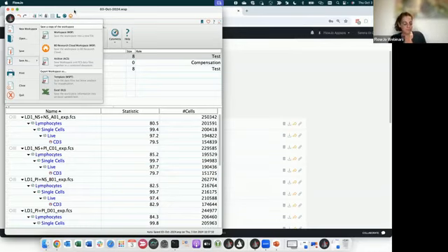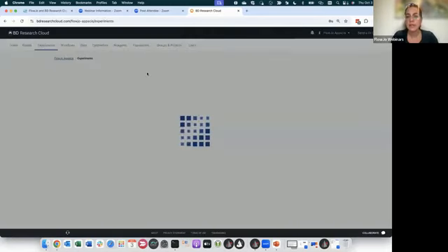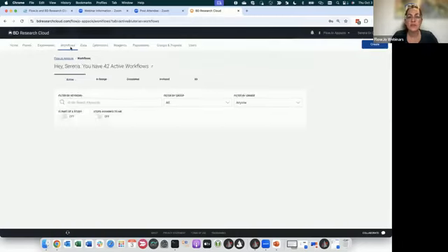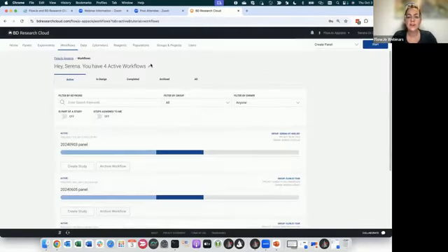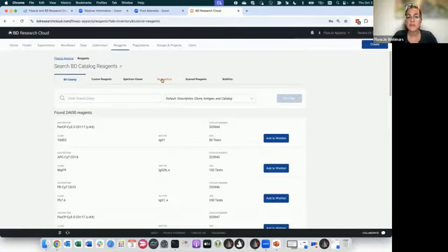These are the general functions, the ones that are most connected to FlowJo itself. But of course, you can generate Diva experiments if you are working with Diva. You can generate workflows. These can be not only panel design workflows, but also instrument workflows. Let's say I need someone to start up the instrument, shut down the instrument, and so on. We have seen data, we have seen cytometers. In reagents, you can also generate your inventory.